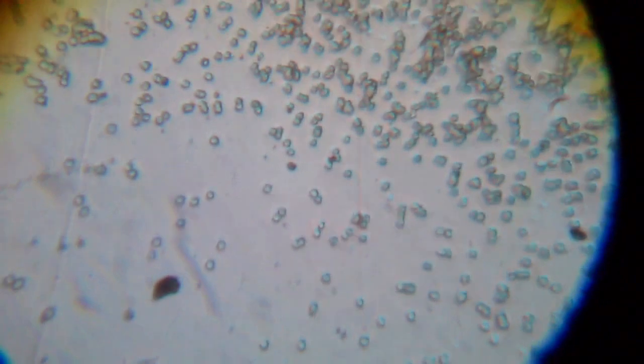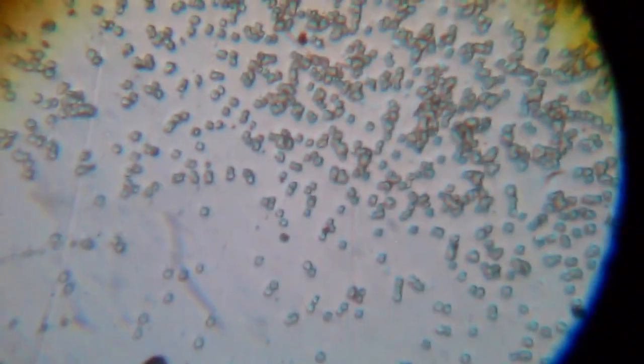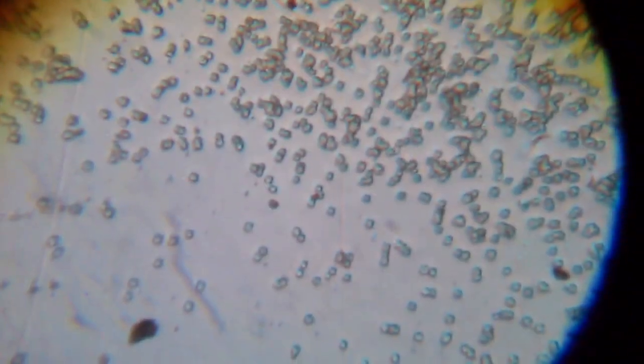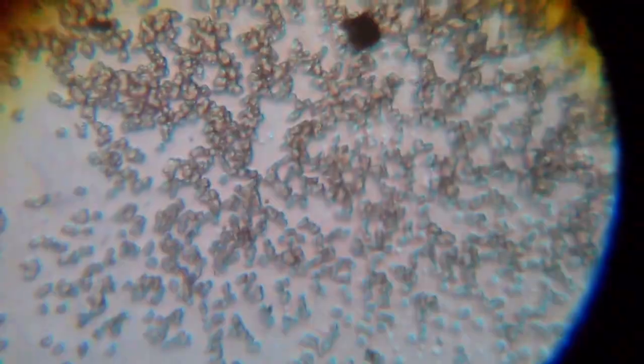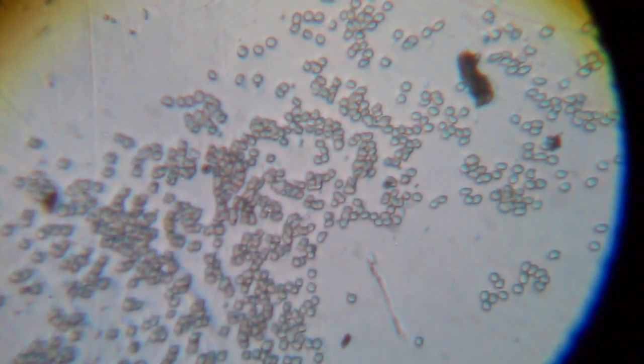This is blood and the little circles that you are watching are the red blood cells. Let's focus a little bit. Let's move around and see other cells like these, these right here, this one. And this is for the red blood cells.